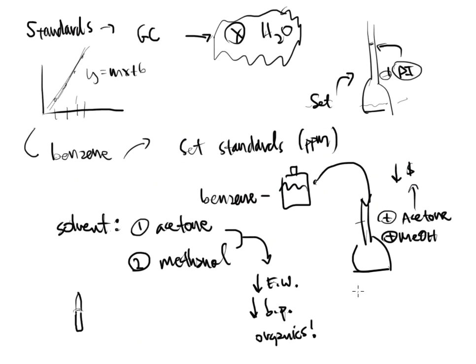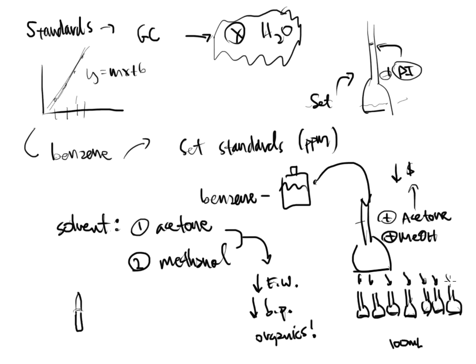If I had to make a set of standards, and let's say I'm required to make 7. So here's 4, 5, 6, and 7, and let's say they're 100 milliliters each. Well, I've added maybe benzene to each one of these, a little bit more, a little bit more, on up from 1 through 7.